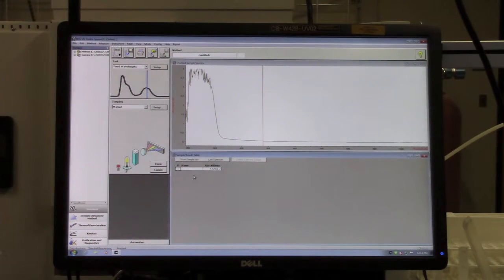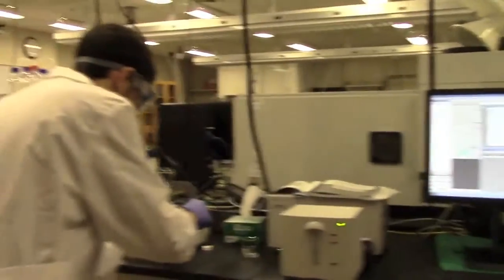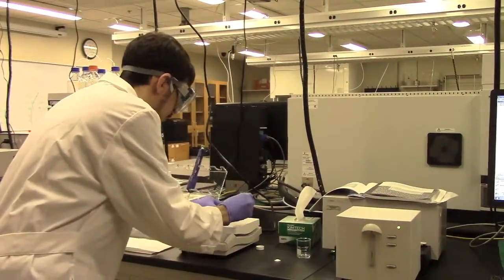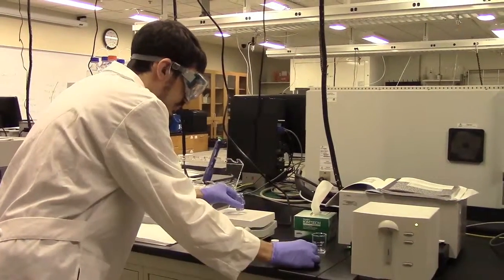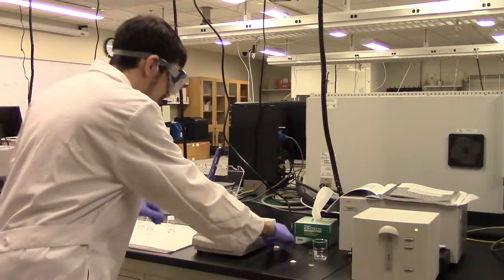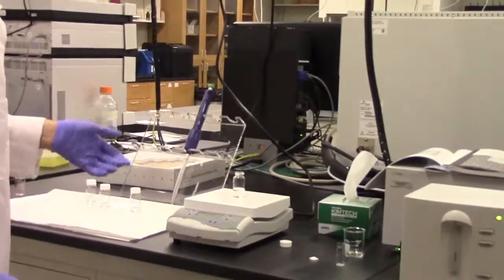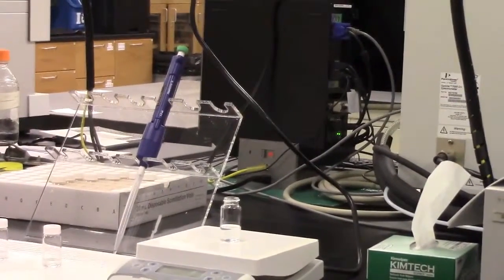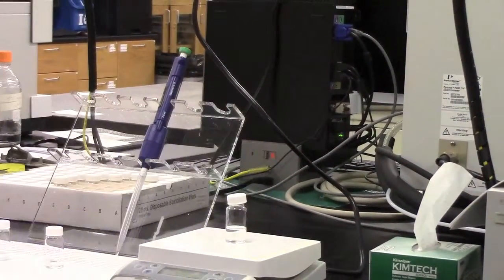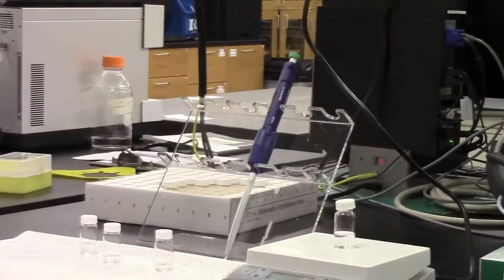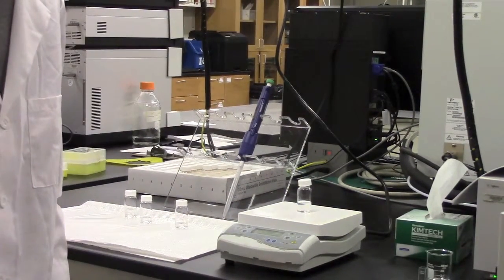Once you've taken this sample, you'll want to quickly return the solution, the reaction solution, back to the vial on the heater, on the hot plate, and cap loosely as before. Leave the vial loosely capped throughout the entire procedure.